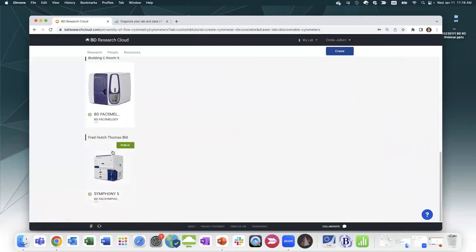As a user, I cannot modify or change the configuration. I just have access to view it and build panels with it. So you don't have to worry about anyone messing up what you input in there. I'll go ahead and unlink here.